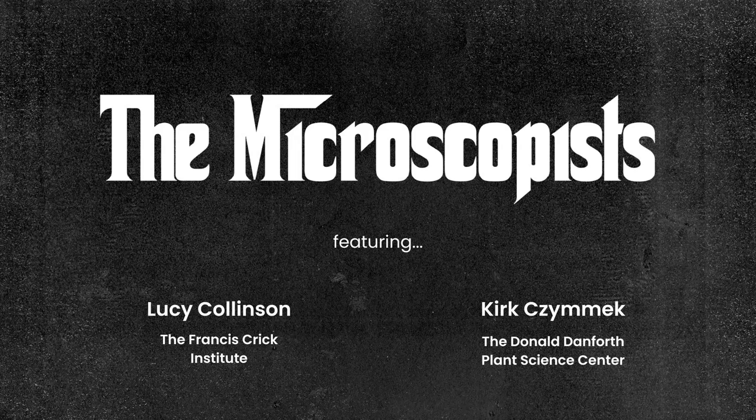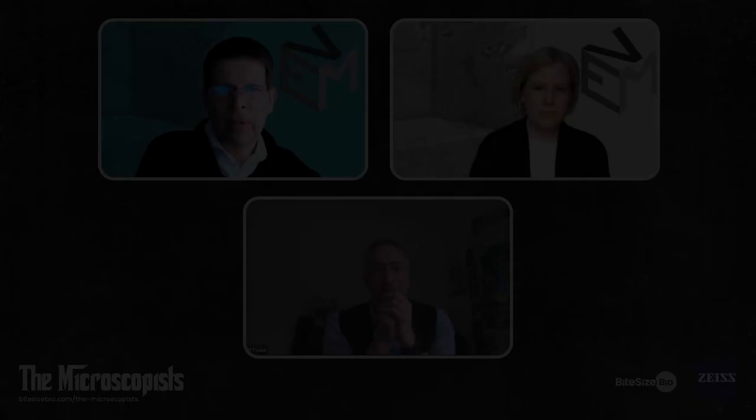How enthusiastic and helpful the volume EM community is. You know, the reality is that it really depends on the biological question which tool is appropriate. And to someone just walking into this tomorrow, it may not be obvious. So definitely reach out. It could be myself or Lucy or even the volume EM community. You can send off a little note and you'll get lots of feedback from people who care.